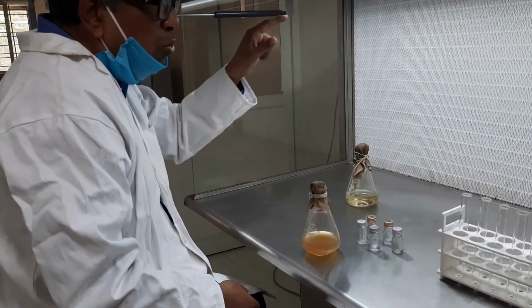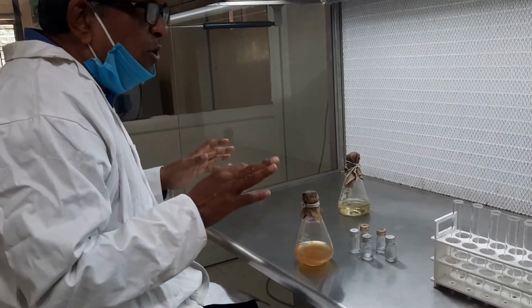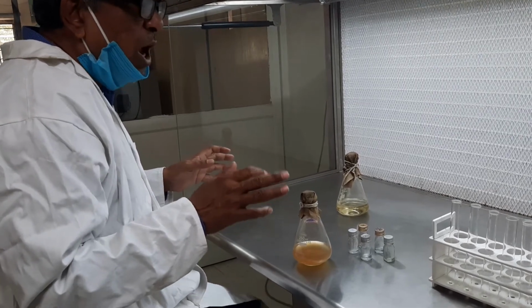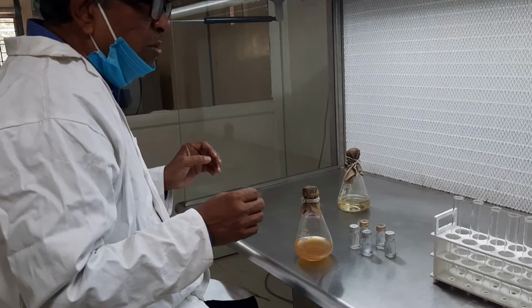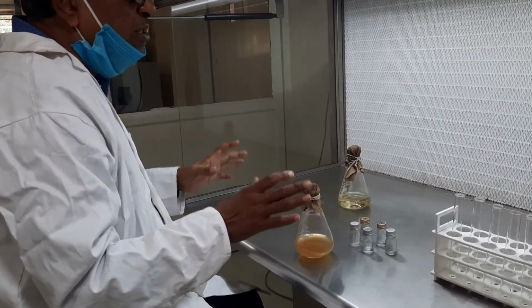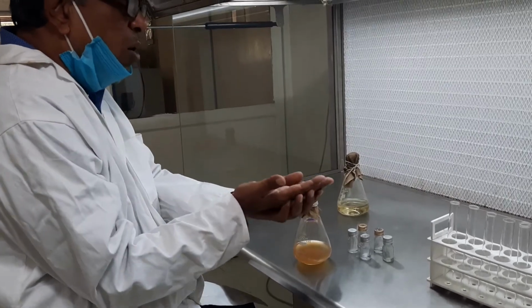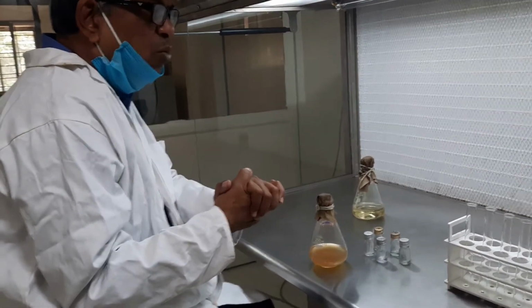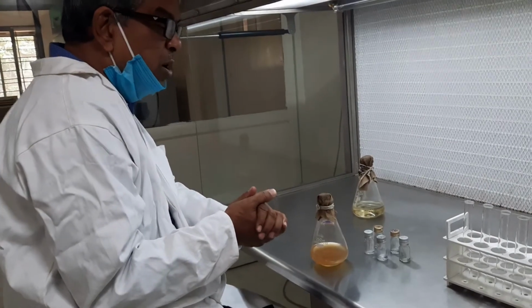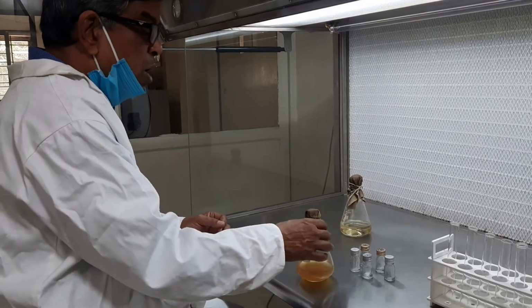Here we have a UV tube. Before the experiment, we will keep it on for 30 minutes so that there is no bacteria or other microorganism present in this hood. This is a closed system, while working we will open it. Now I have washed my hands with isopropyl alcohol so that I can work without gloves, because with gloves these small tubes are very difficult to hold.